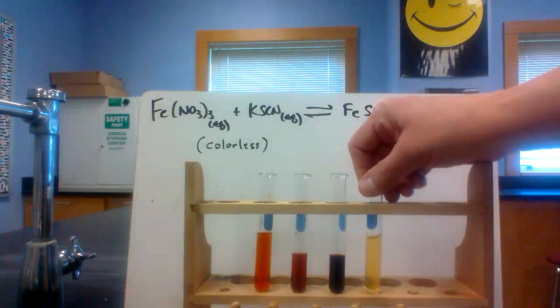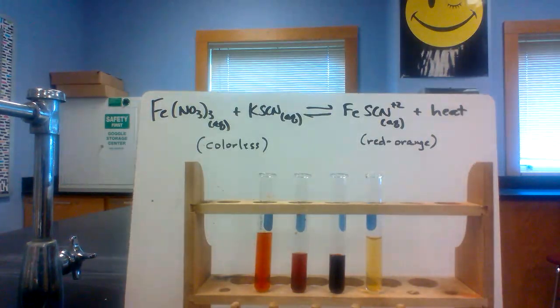Now notice I'm adding it to the entire system. Sometimes people start saying, oh, I added it to the reactants, or I added it to the products. No, I have this whole system in the test tube, right? I have reactants and products all mixed together, and I added the sodium hydroxide. And you can see that it turned very pale. I would almost call it a super pale yellow, okay? Not colorless, but super pale yellow.